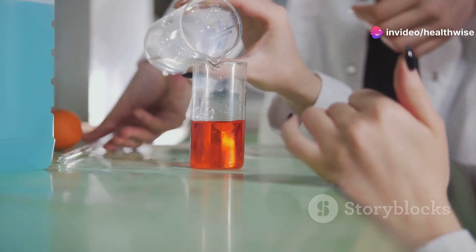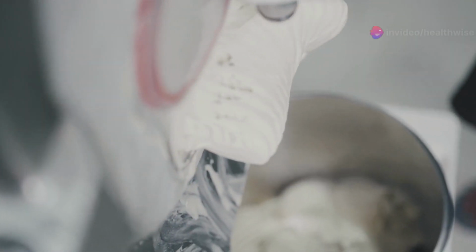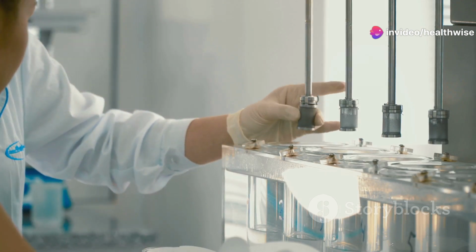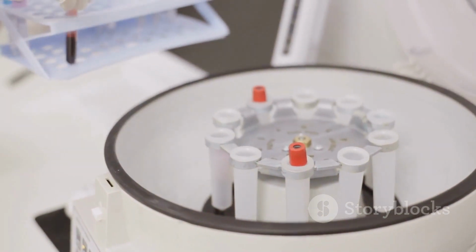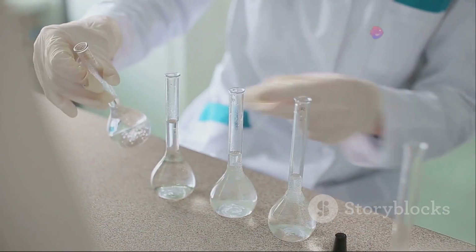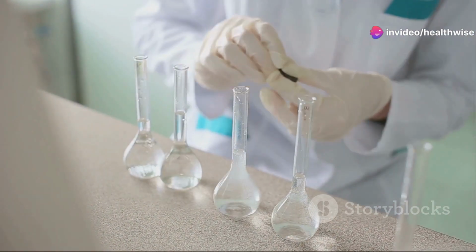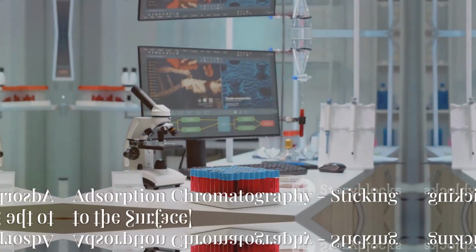As our mixture of molecules travels through the column, they constantly interact with both phases. Molecules more soluble in the stationary phase will spend more time clinging to the solid support. On the other hand, molecules more soluble in the mobile phase will be carried along faster. This difference in affinity causes the molecules to separate as they move through the column. Partition chromatography is a versatile technique used in various applications, from separating and identifying drugs in forensic science to analyzing food components in the food industry.